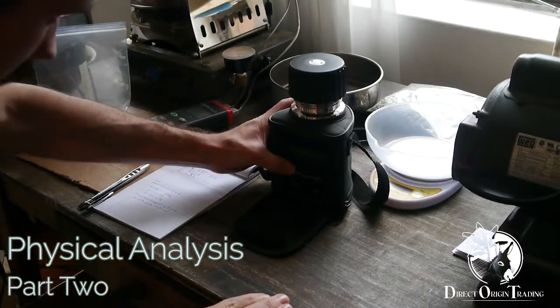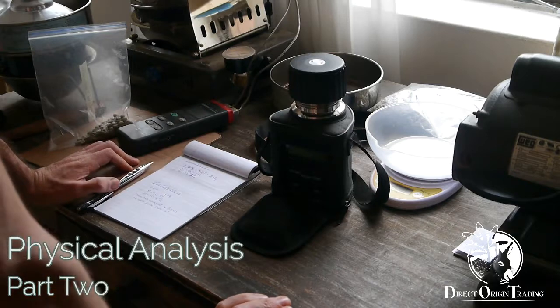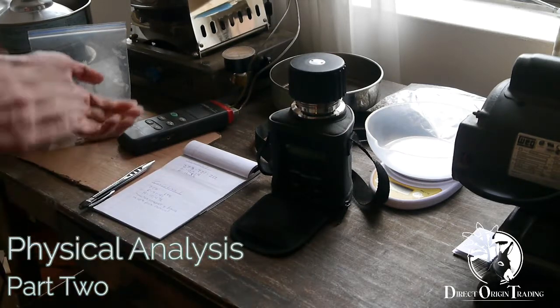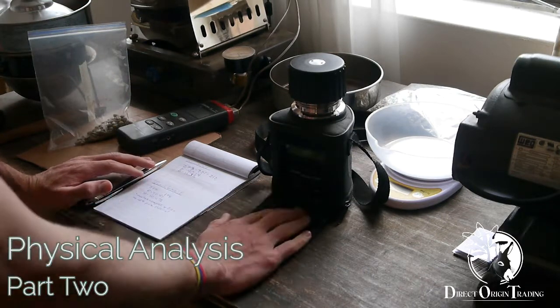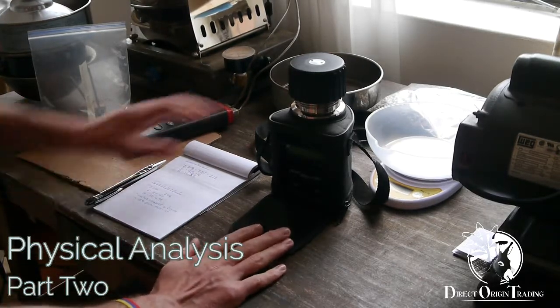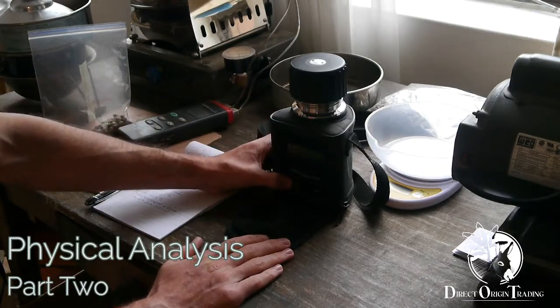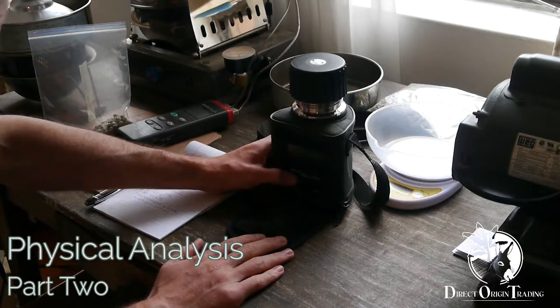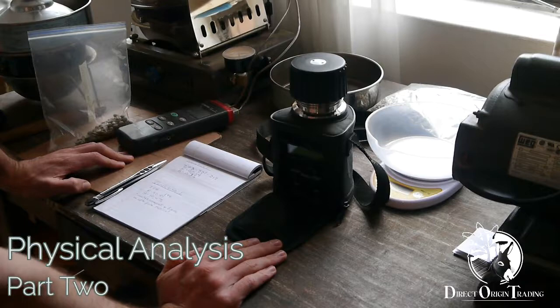We actually get quite a lot of samples with very high moisture content, too high. The limit to export out of Colombia is 12.5%, but we try not to work with anything over 11.5%. 10.5 to 11% is what we like to see. Some people go even lower than that, but we find you can develop some dry straw, dry leaf notes if it's too low, such as below 10%, which also happens.